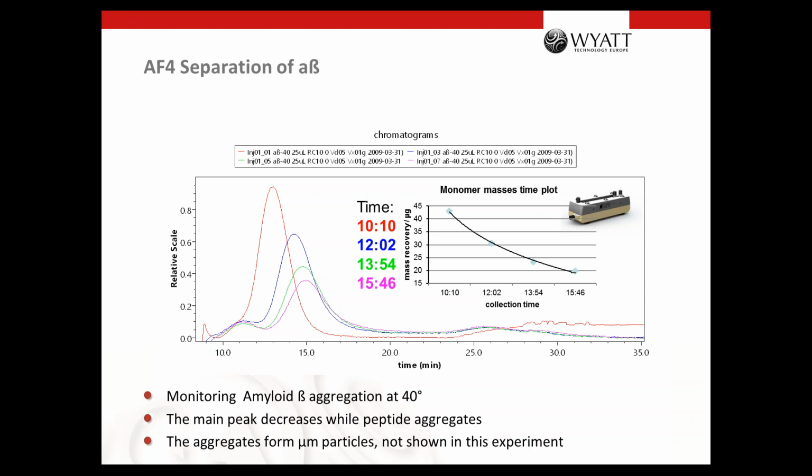Sometimes you use too high a cross flow or focus flow, for example, and it can happen that the sample sticks on the membrane surface. That happens rarely, but it can happen. Then you need to screen different focus conditions, which can also cost you half a day. So it's very flexible. It can take 2 hours up to 2 weeks, let's say, in the most extreme case.